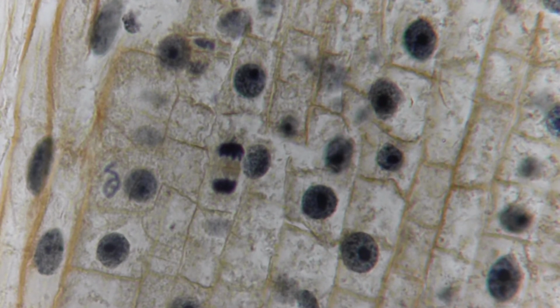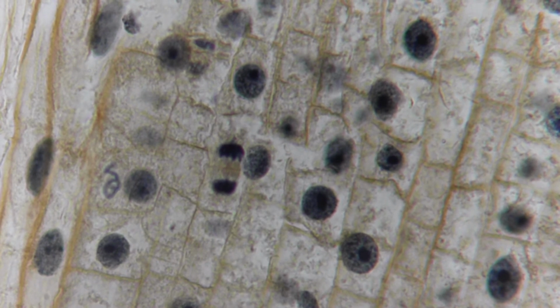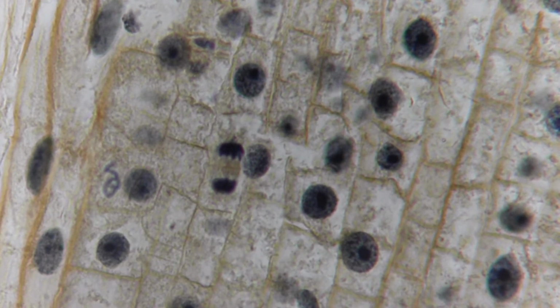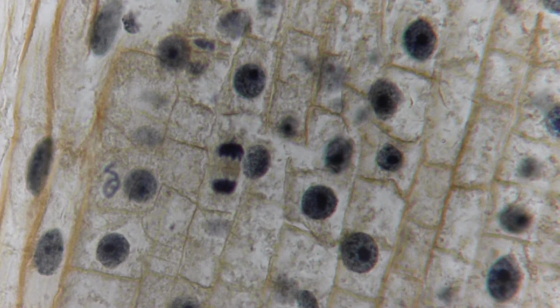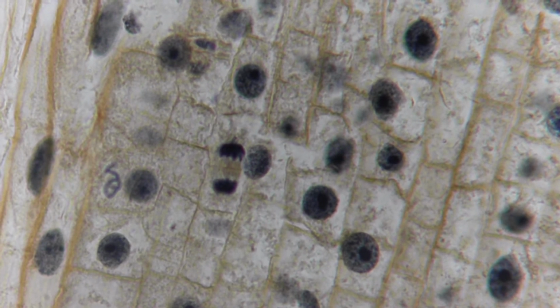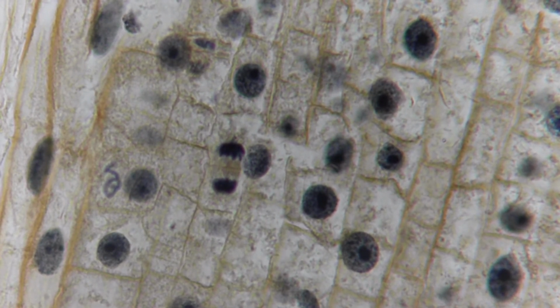And then at some point, a little line will start forming across the spindle figures, and it's the cell plate. Now this one hasn't formed the cell plate yet, but draw it like this, and then draw a faint little line between those two masses of chromosomes and label that cell plate. I have one over here that shows that, but the chromosomes aren't near as good.